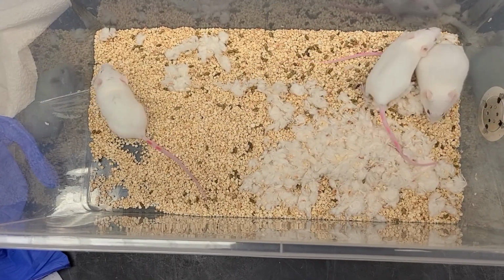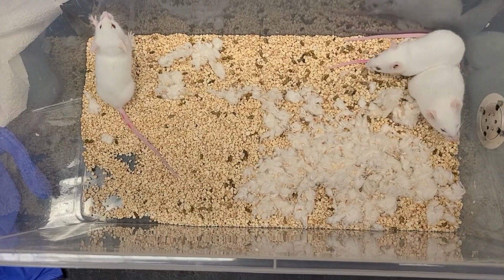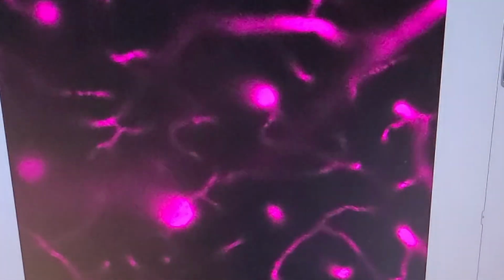So that's where I do all my in vivo imaging experiments, where I examine blood vessels or cerebral blood flow using 2-photon microscopy. That setup is in Baltimore. And then I'm gonna drive down to College Park and proceed from there. So we'll do some mouse work. We'll isolate some vessels and feed cells.